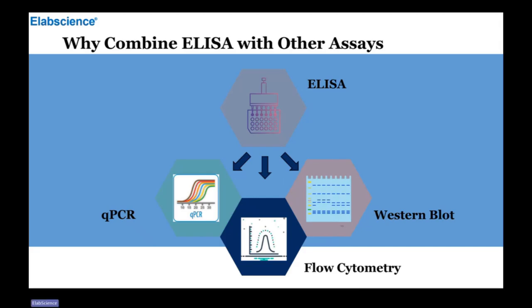ELISA also provides the protein level measurements, but it only tells part of the story. Combining it with other assays gives us a multi-dimensional view. That is the start of translational research.